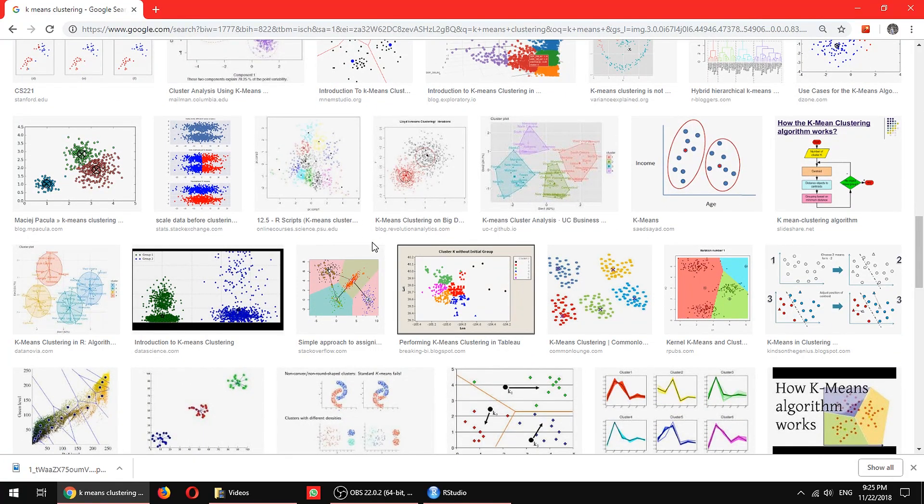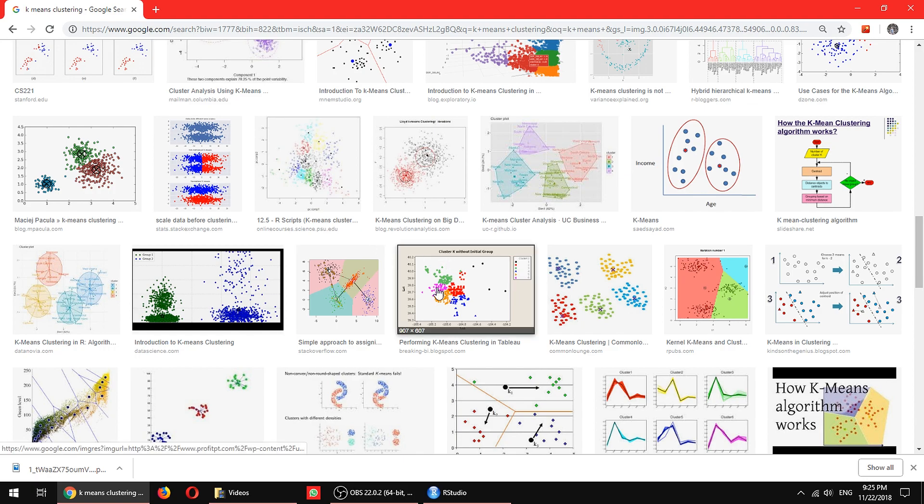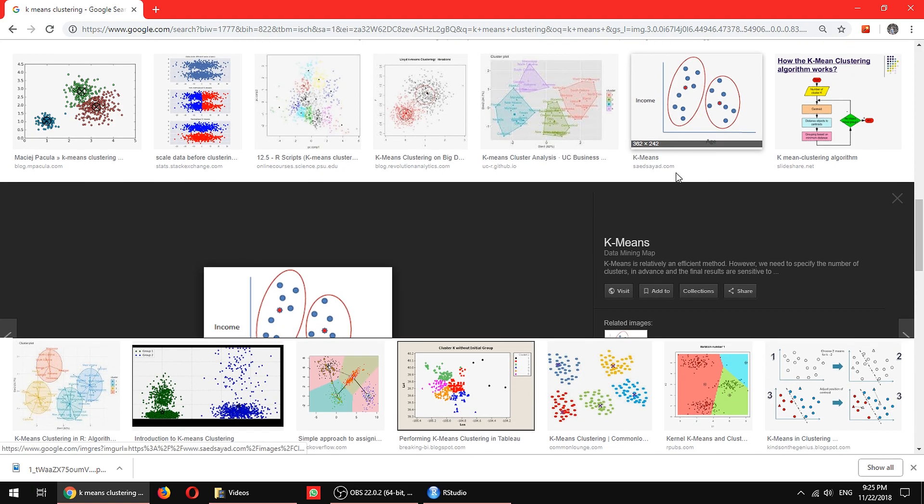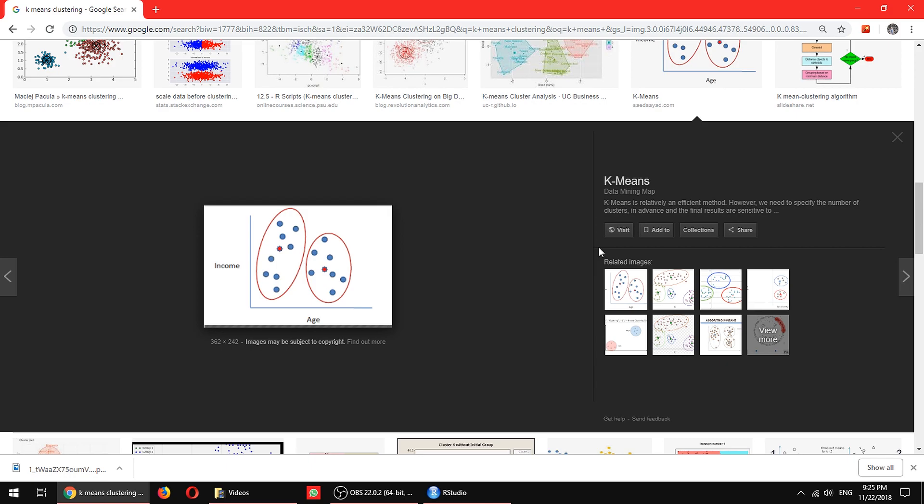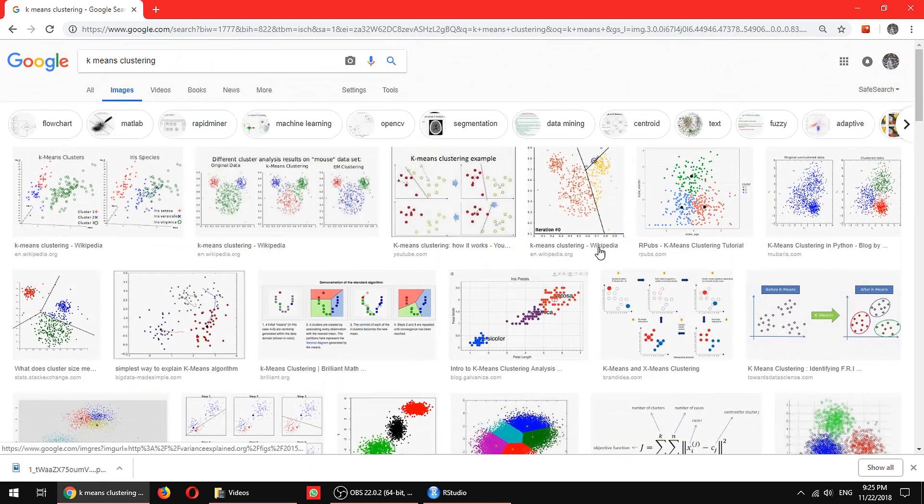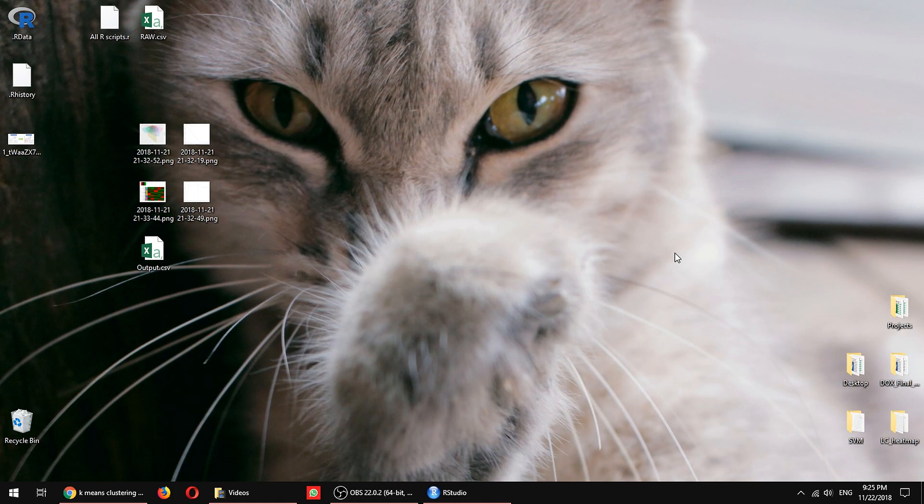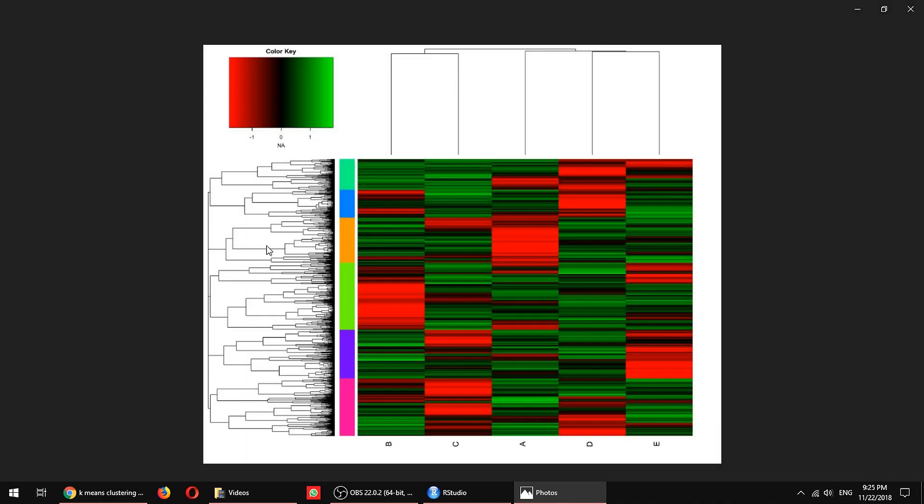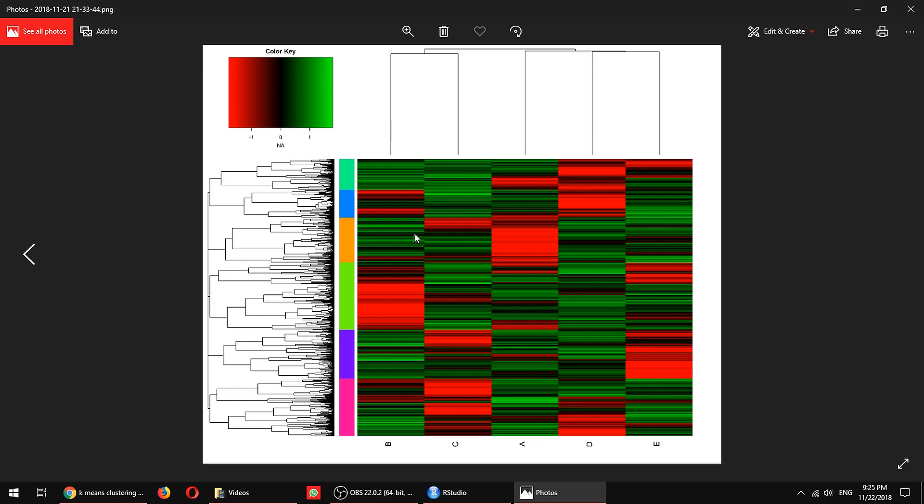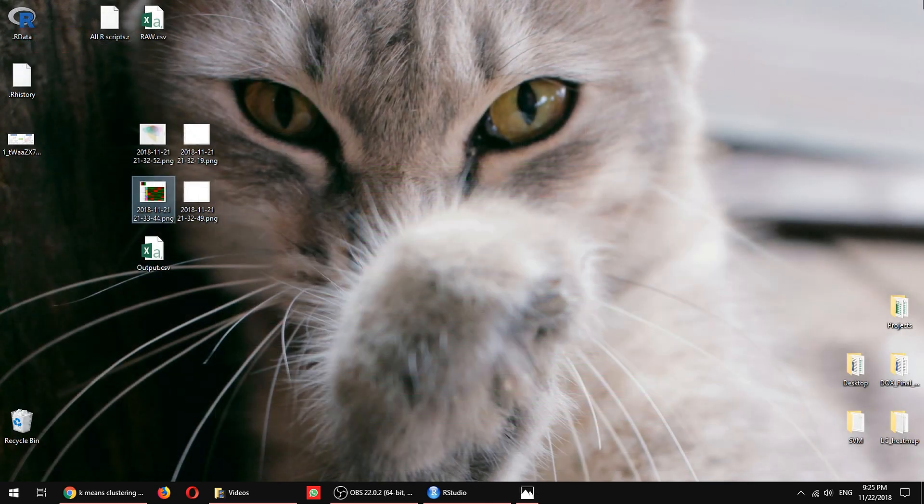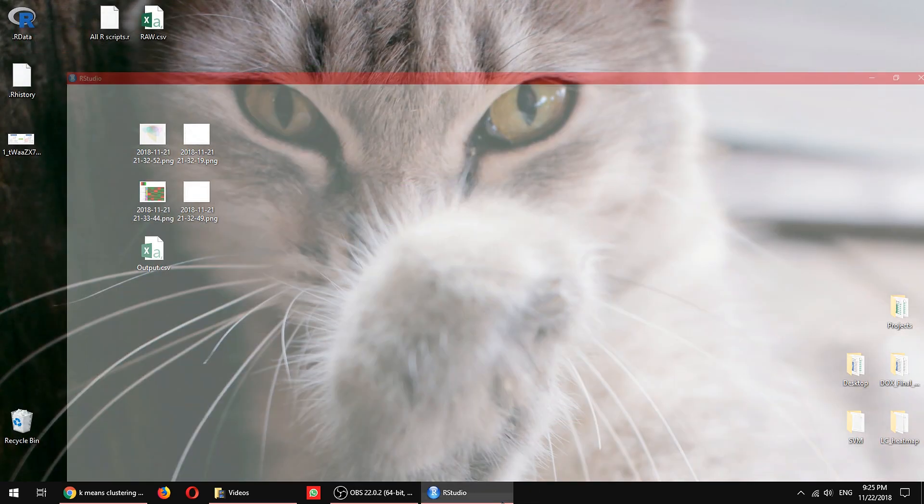There's a really great video on crash course on this one. I strongly suggest you go and look at it if you actually want to understand what k-means clustering is about. I'm just going to use it as a logic and as an excuse or suggestion on how many clusters do we need for our data point. Because in the end, I'm just going to use hierarchical clustering because I'm able to fish out which transcript do I need.